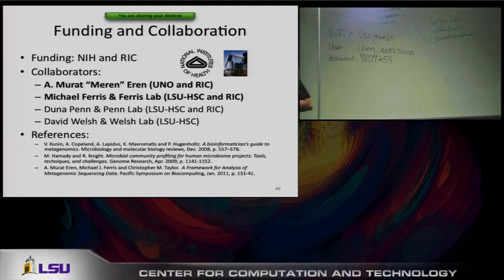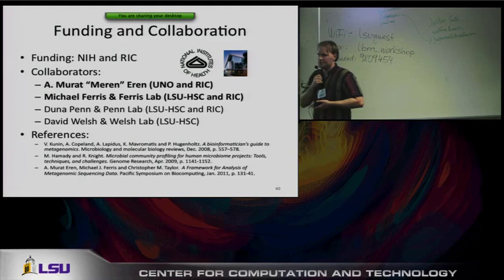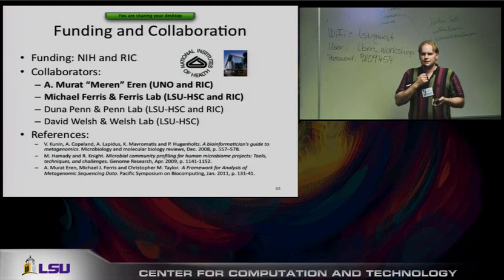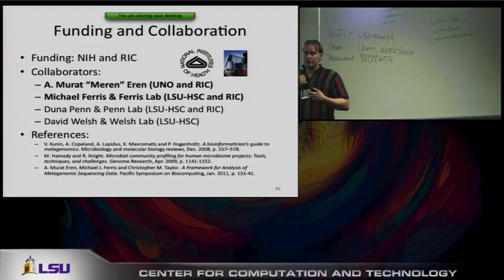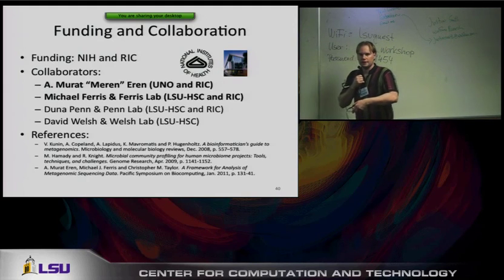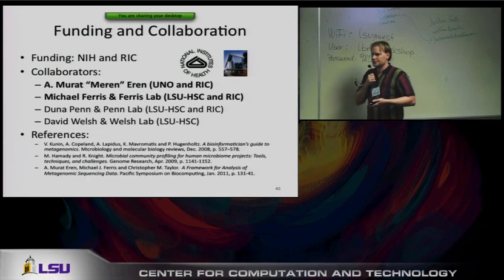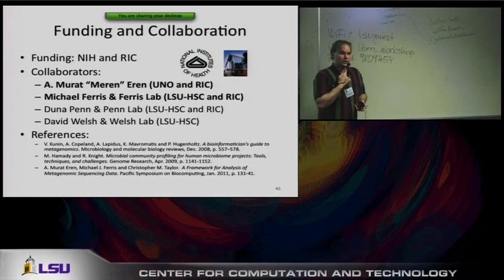Oh, right. So the second question is, why don't we look at the directly related genes that might be a factor in these diseases? And that is, of course, the Holy Grail. Right now we're just doing 16S ribosomal sequences to look at communities. But if you wanted to spend a lot more money on your sequencing, why not just sequence the whole genomes of all the organisms instead of just pulling out the 16S? There are people that are doing that, but we're not quite yet that well funded.